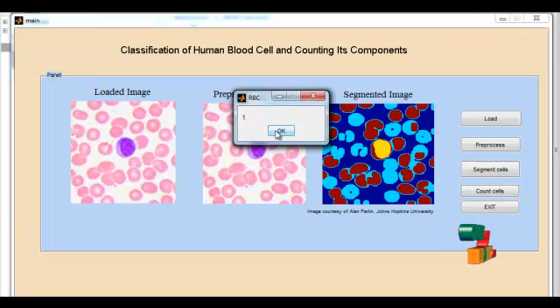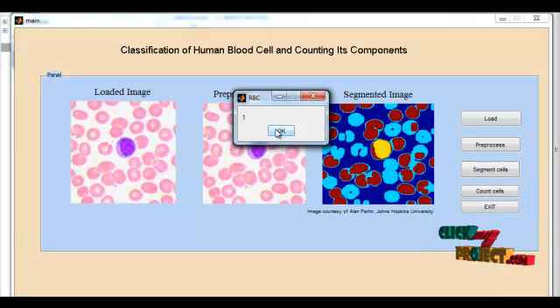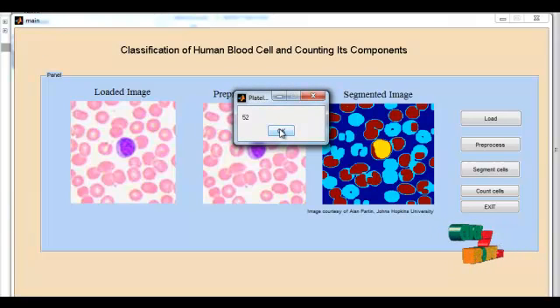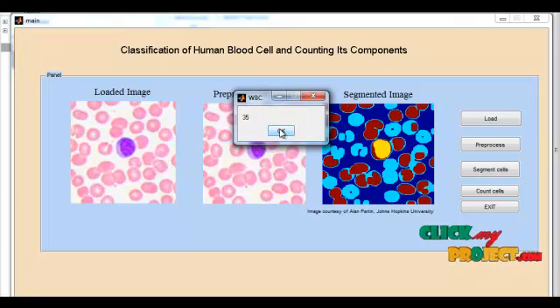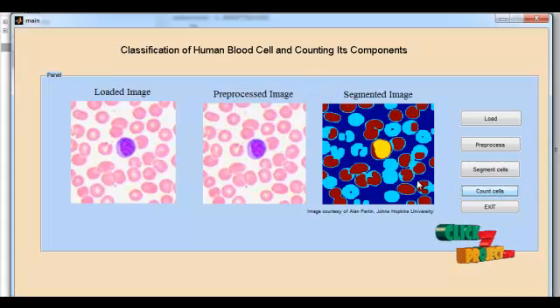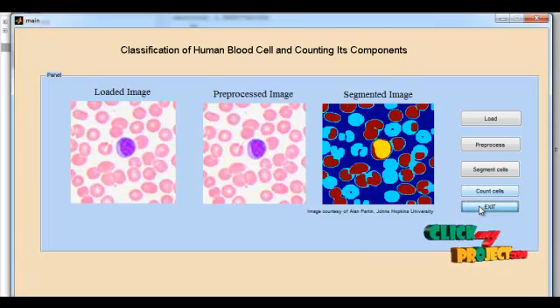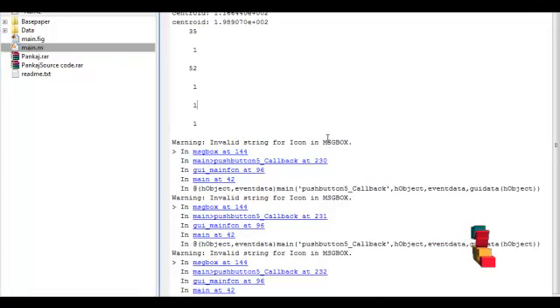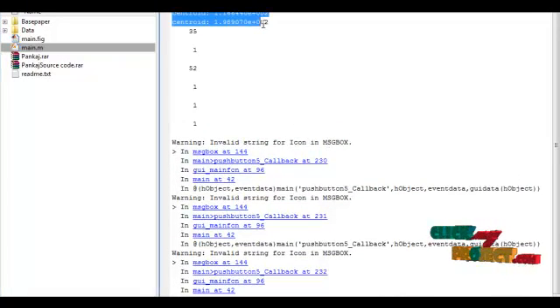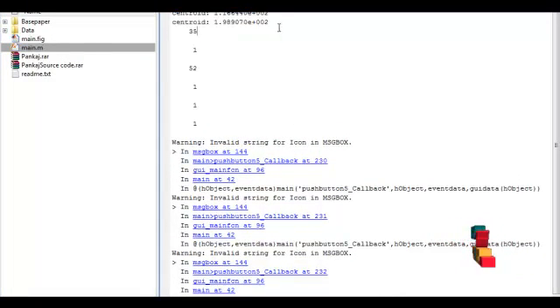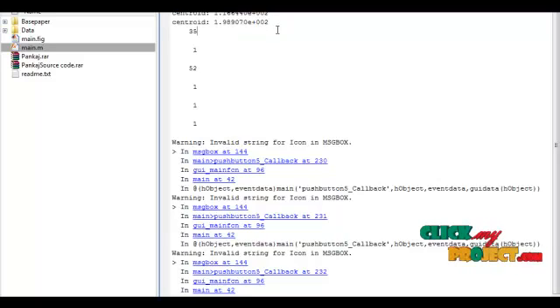The results show that there is one RBC, 52 platelets, and 35 WBC cells in the selected image. After that, press Exit to exit the project. In this project, four types of centroid values are also displayed. Thank you.